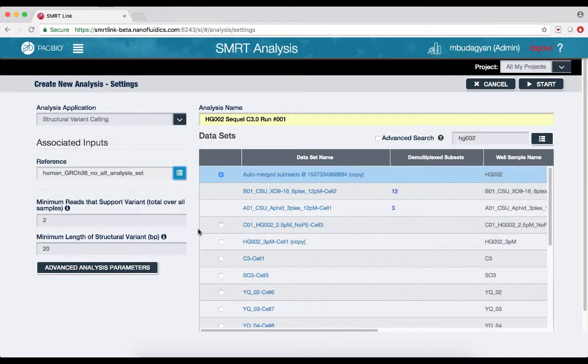There are two basic parameters: the minimum reads that support the variant total overall samples, with a default of 2, and the minimum length of the structural variant in base pairs for it to be called, with a default of 20 base pairs.